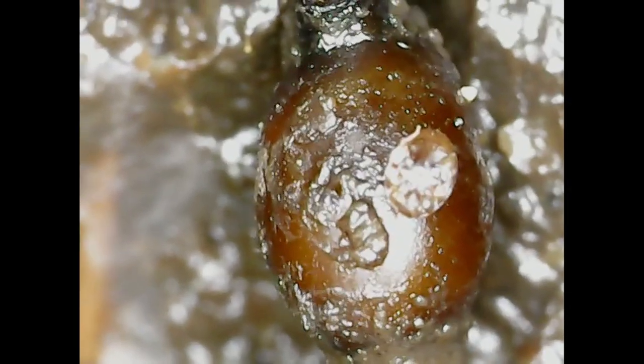Well, that might be a worm cocoon right there. I'm gonna turn this off, see if I can get that out, whatever it is, and see if that is a worm cocoon, see if I can find out exactly where I'm looking at right now. It was. It was an old worm cocoon. Let's isolate that really fast. That's an old one. They darken as they age, pretty much. So let's isolate that really quick.